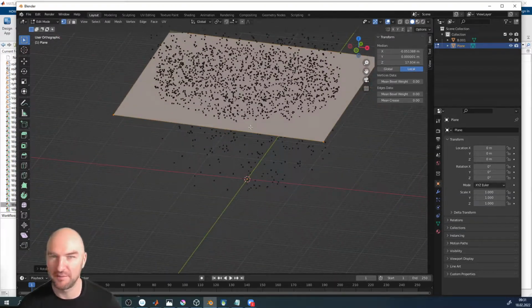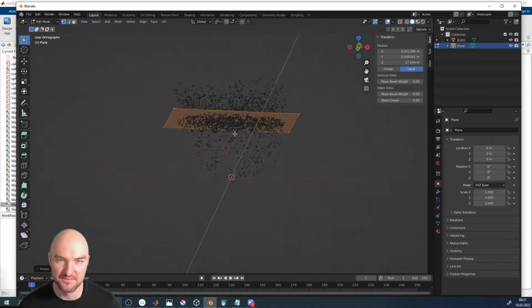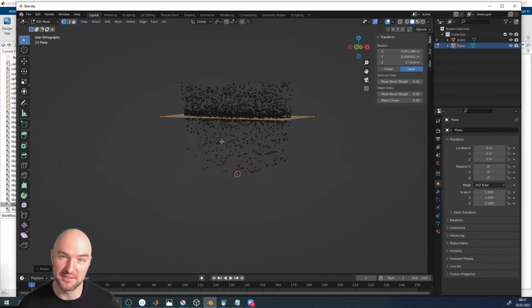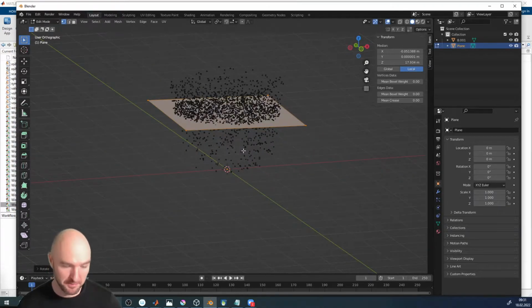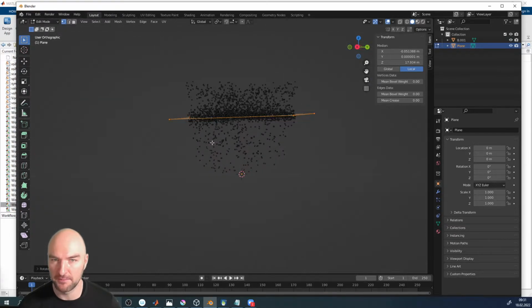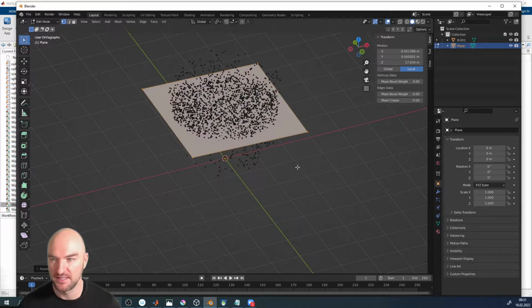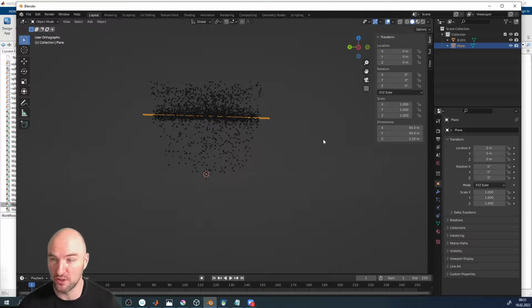Do we? I mean, it's sort of a little bit larger than the data set. It's obviously very simple because it has only 4 vertices. But it depends on what you want to do. So if you want to do a proxigram to your grain boundary, yeah, that would be enough. That would actually do the job.